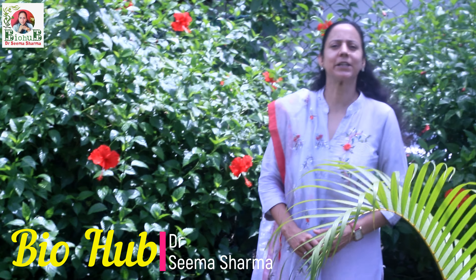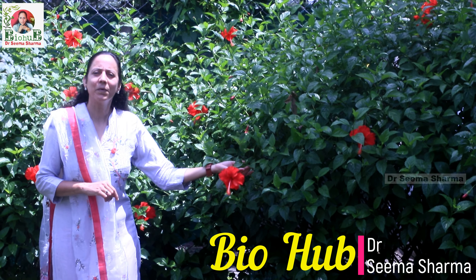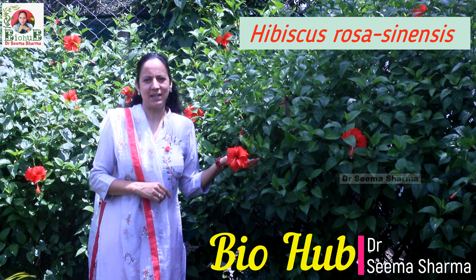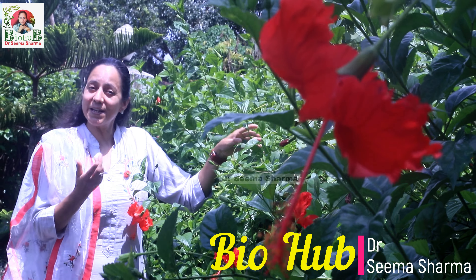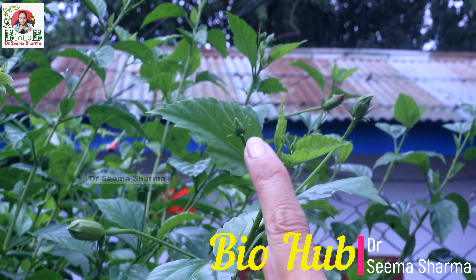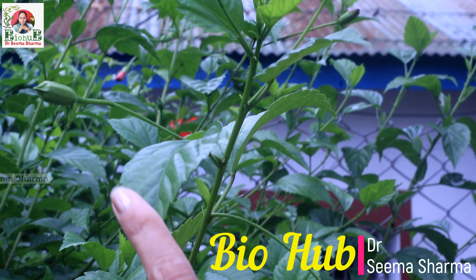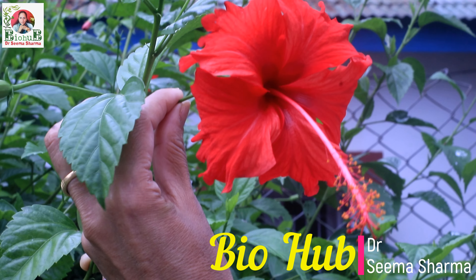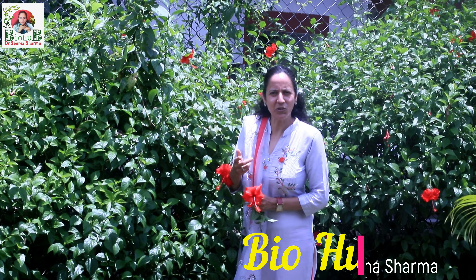Hi friends, you are watching BioHealth and I am your biology facilitator Dr. Seema Sharma. This video is about dissection of flower of Hibiscus rosa sinensis. The shrub behind me, which is in full bloom, is Hibiscus rosa sinensis. It is commonly known as shoe flower or China rose. The journey of a flower starts on the reproductive shoot of the plant. Here you can see there are three floral buds of different developmental stages, and all these will gradually grow and transform into attractive red colored large actinomorphic flowers. So let's pluck a flower and move in to begin with its dissection.